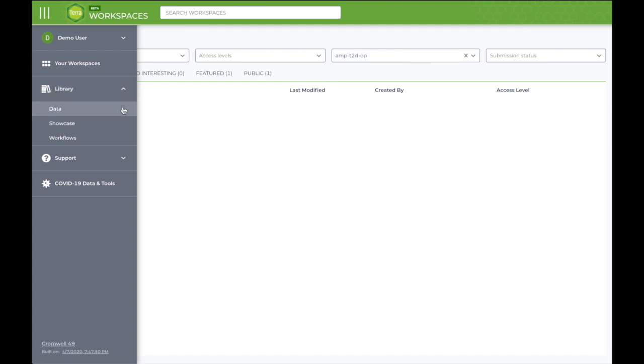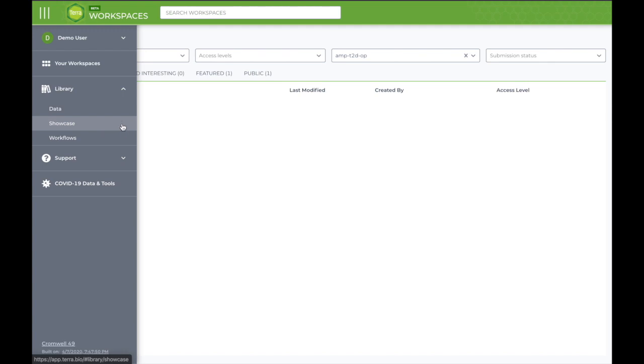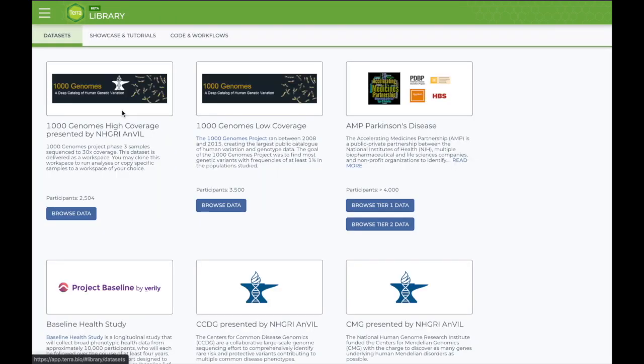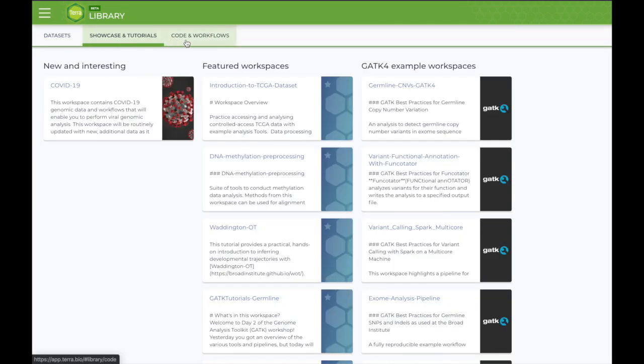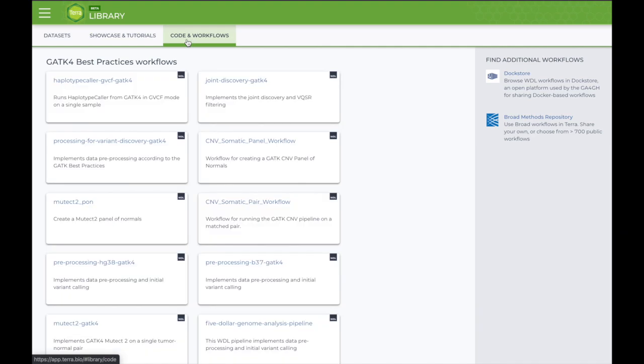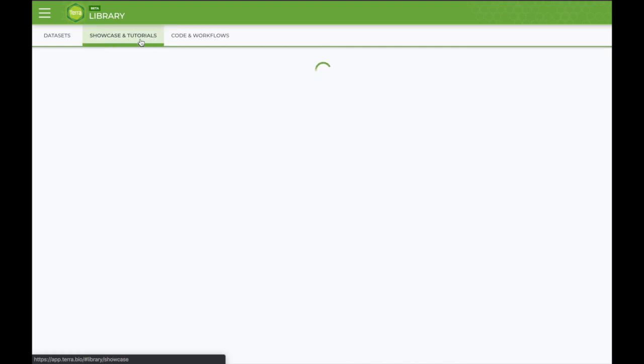You can access each of these links from within the library menu, but they're also accessible through each of the tabs at the top of the library page. Let's go over each of them now.